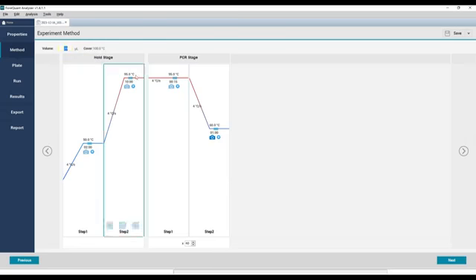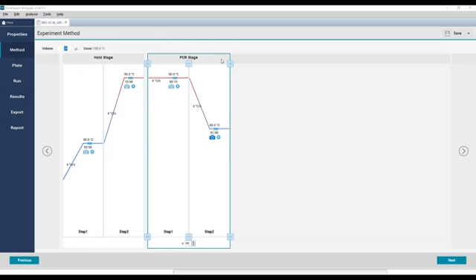Reaction stage setting. Set the reaction stage and steps according to the actual reagent instructions. If you need to increase or decrease the PCR reaction stage, such as an extra PCR reaction, you can move the mouse to the reaction stage area and click the Add or Subtract button. The Add buttons on the left and right mean adding another stage before or after this stage, and the Subtract button in the middle means removing this stage.